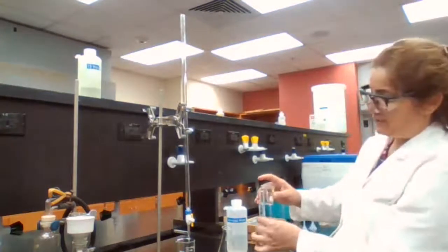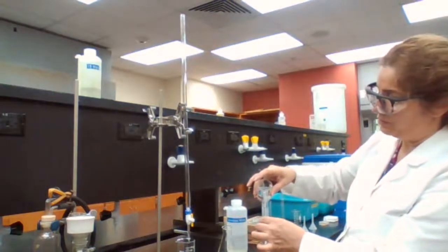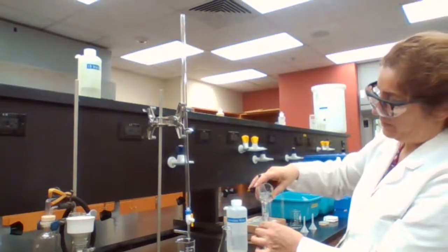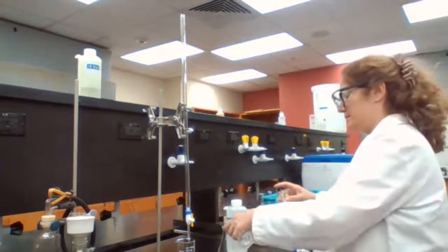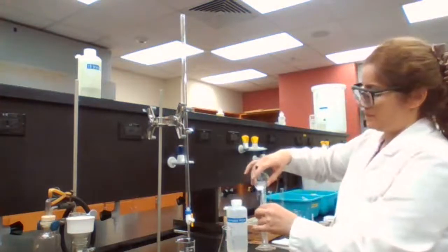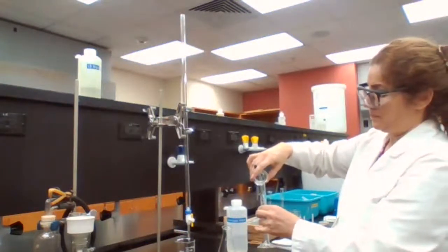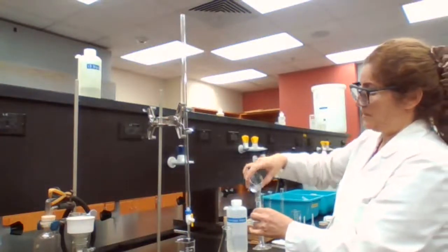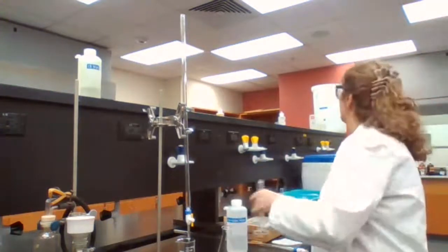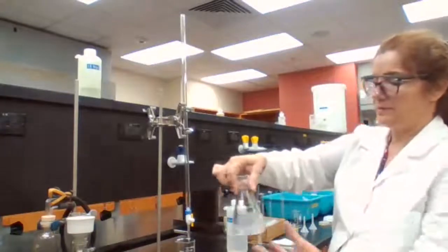I have to measure 50, but they gave me 25 milliliter graduated cylinders. I have to do it 2 times. Okay. 50 milliliters of ethanol.